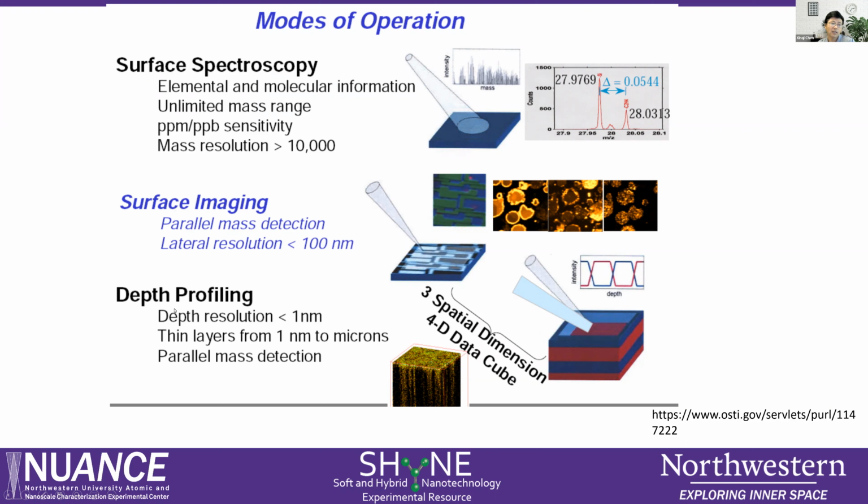The third data type is depth profile. So you can sputter and then analyze, and you can get certain elements and how they change along the depth, so you get the depth information. Based on this data, you can do 3D rendering and 3D reconstruction, which is great.